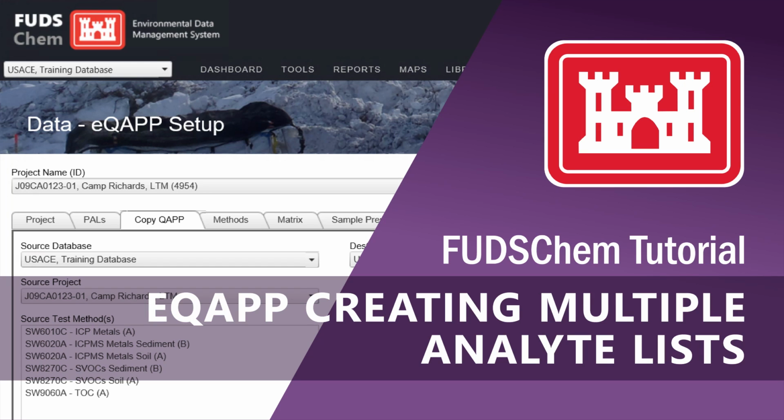This video will go over how to efficiently create multiple Analyte lists for a method in your eQAPP. You might do this if you have a short list of analytes and a full list of analytes for the same method, such as BTEX and total analyte list VOCs.